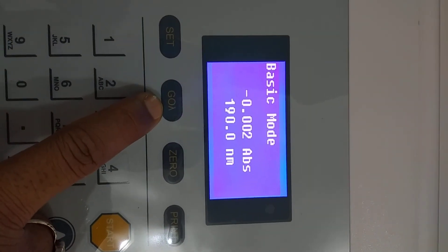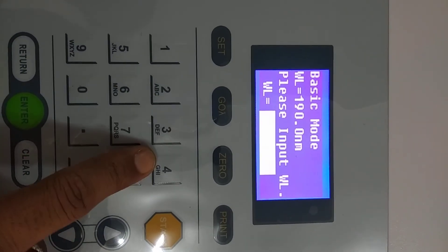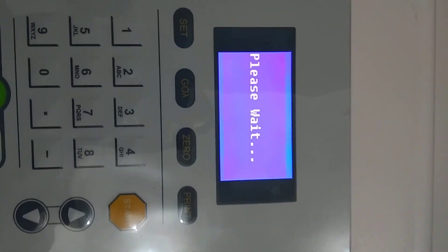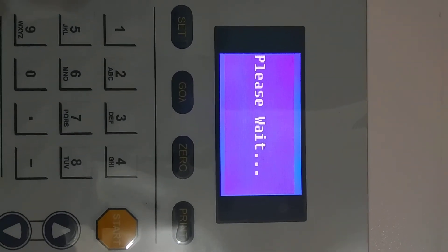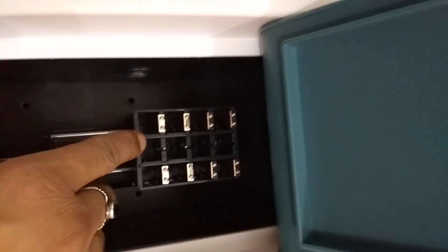This is the Go Lambda key — your wavelength selection key. Press it and enter your desired wavelength. For example, enter 430 nanometers, press Enter, and it will automatically set the wavelength, which is then displayed on the screen.